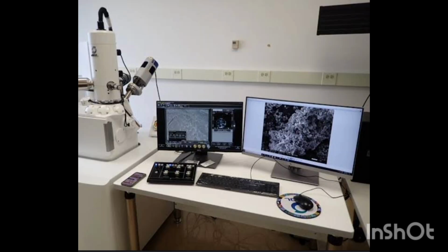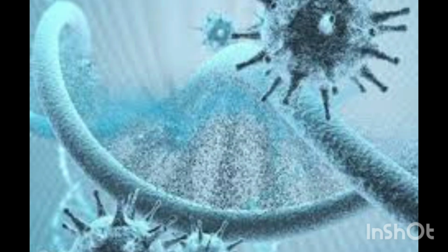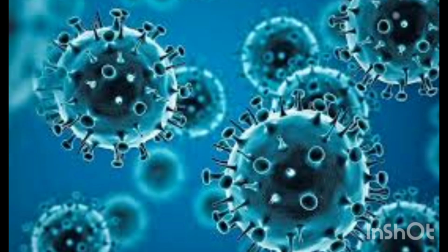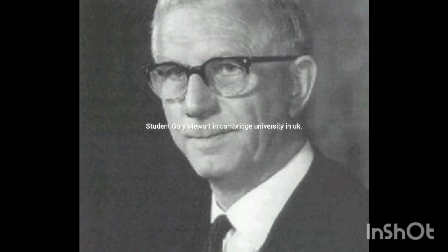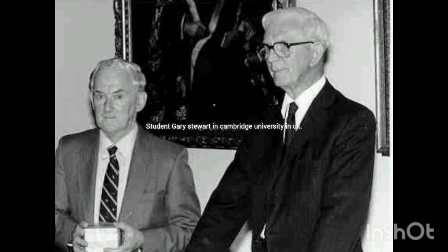Development of the scanning electron microscope. While the transmission electron microscope was the first type invented, the scanning electron microscope was developed later. The first practical scanning electron microscope was developed in the 1960s by Sir Charles Oatley and his student Gary Stewart at Cambridge University, UK. The scanning electron microscope became popular because it provided 3D images of specimens.